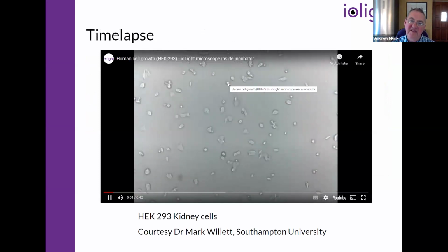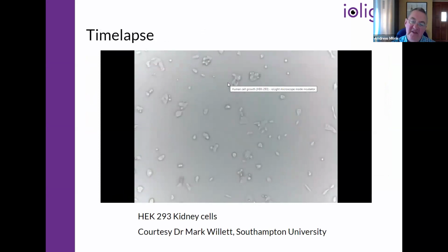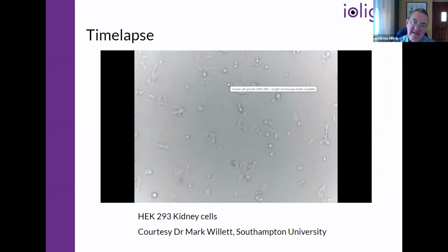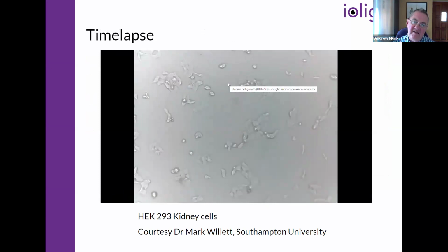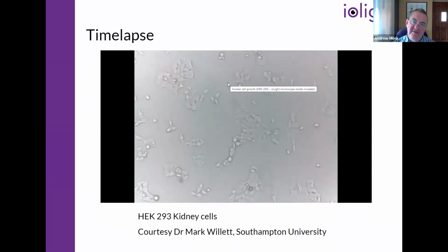And this is a video of some human kidney cells that are being grown in a lab at the University of Southampton, very near to where we are. This is HEK293, a typical cell line. And this is a time-lapse image. It's taken one picture every 10 minutes for 48 hours.